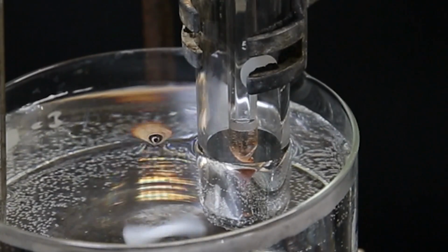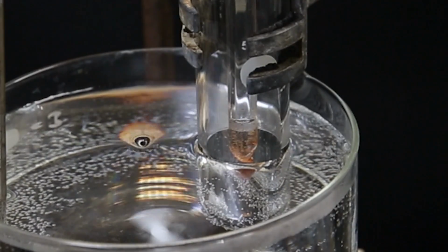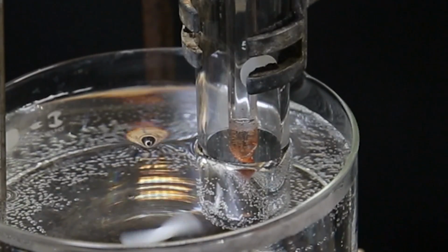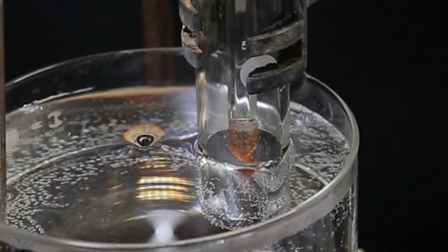When the ABNO sublimes into a gas, it will get pulled upward along the cold finger. Since the cold finger is, well, cold, it will deposit onto the cold finger and collect there. The cold finger is also too cold for the ABNO to easily sublime again, and thus it will stay there.